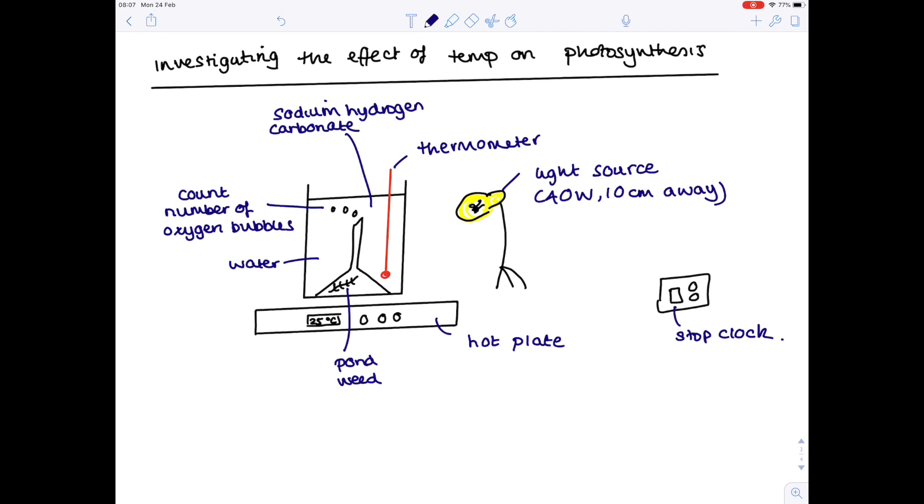Now, if you were to alter a different factor, so if you were to look at how the carbon dioxide concentration affects the rate of photosynthesis, you obviously wouldn't need a hot plate this time. You would alter the carbon dioxide concentration by altering the mass of sodium hydrogen carbonate that you added. And then lastly, if you were interested in how light intensity affected the rate of photosynthesis, you could simply move that lamp 10 centimeters away, 20 centimeters away, 30 centimeters away. But just making sure that the temperature and carbon dioxide levels remain constant so that you only have one independent variable.